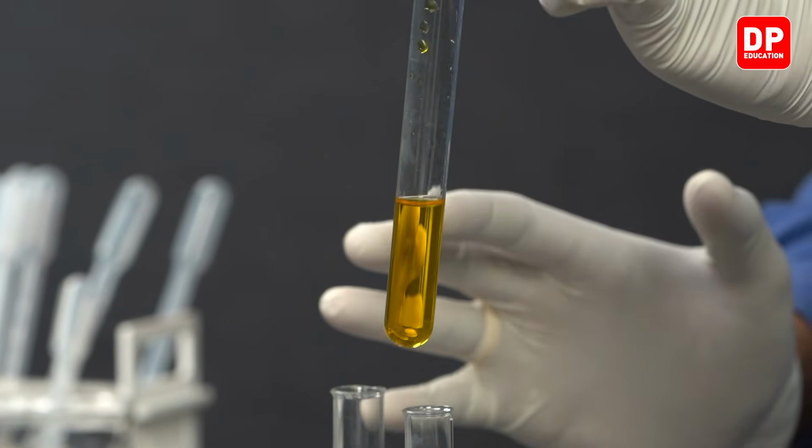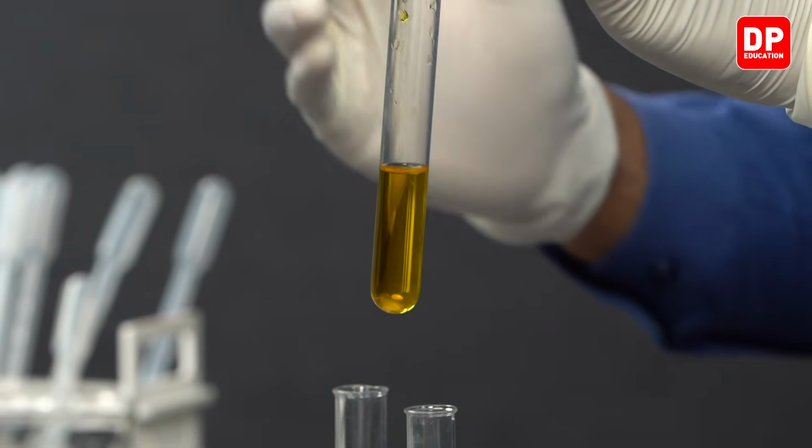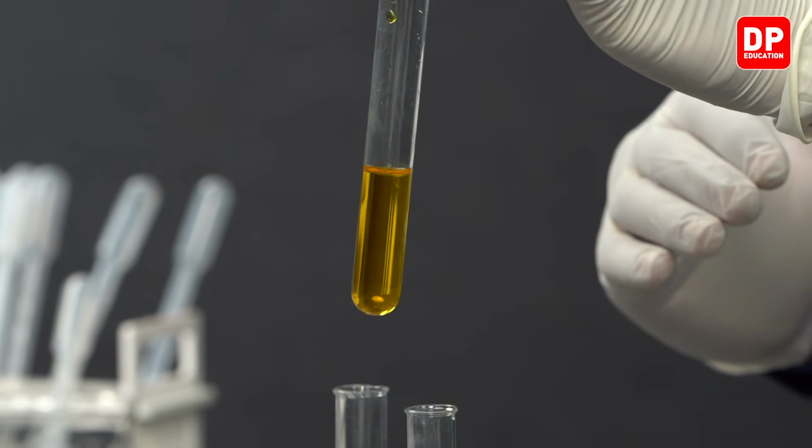Now, to make this observation very clear, we are first going to dilute this solution a little further so we can observe this color change a bit clearer.